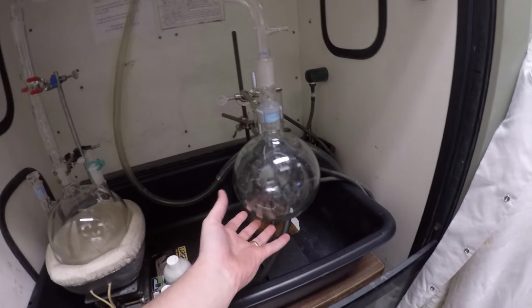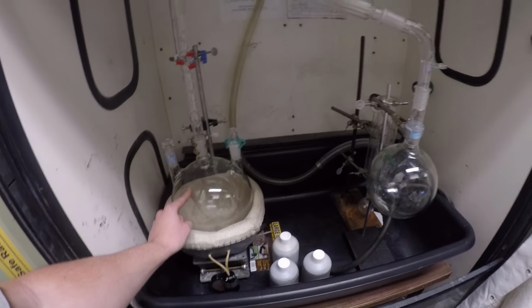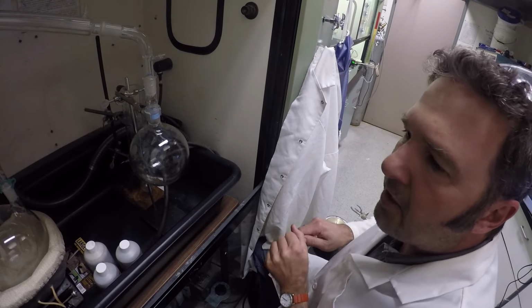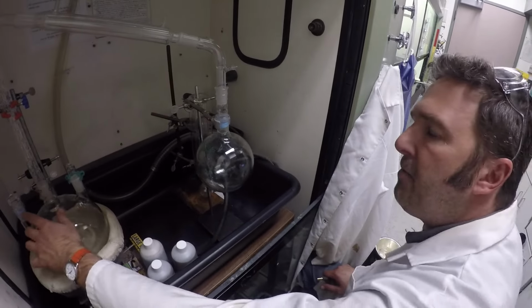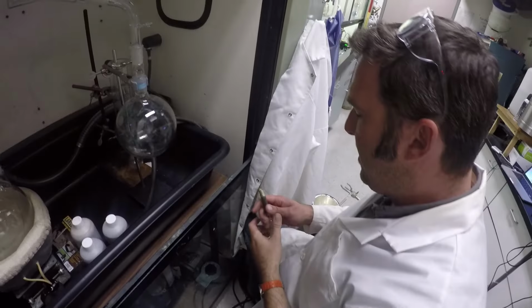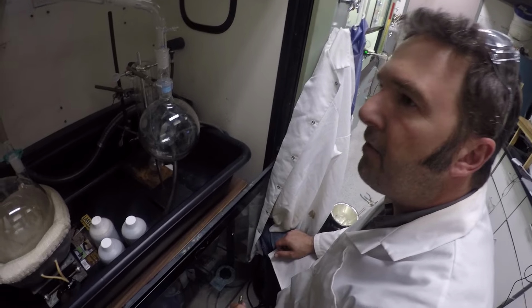So we have this giant orb, an even larger orb. How many liters is this, 5? Yeah, that's called a round bottom flask, because of the round bottom. So that's a 5 liter flask, so we could easily put most of our mercury in there. We can do most of it in one shot. It's terrific. This is just a mock-up right now. We need to put Teflon on all the joints because we're pulling vacuum on this. And I'm making a plug for the very top. We won't be able to run my thermometer, but aside from that, we will be able to do everything else that I wanted to do.